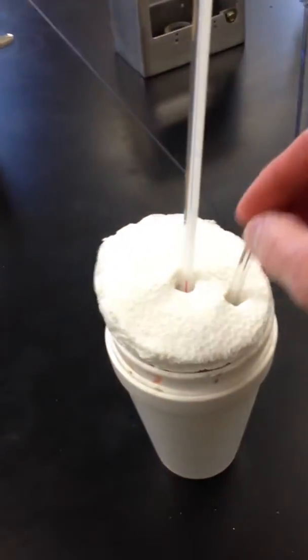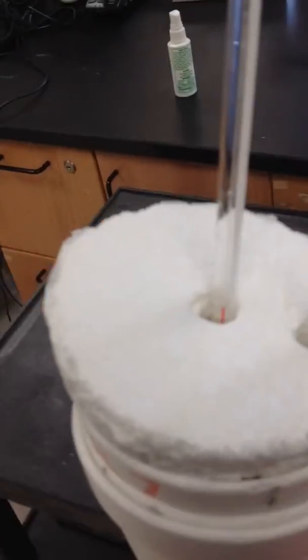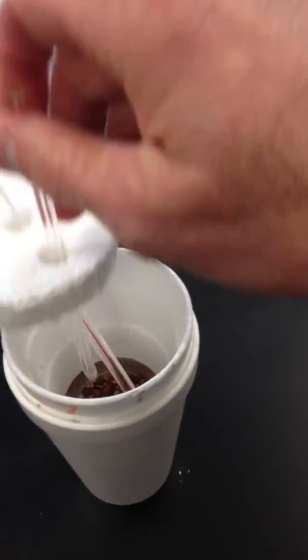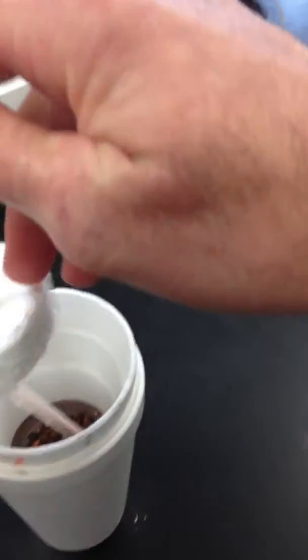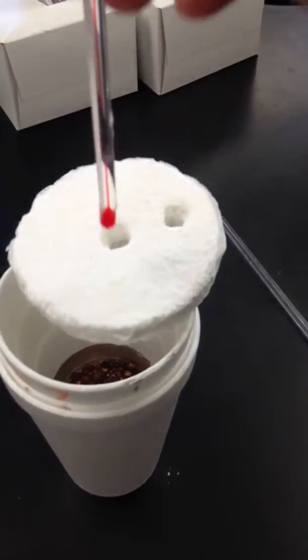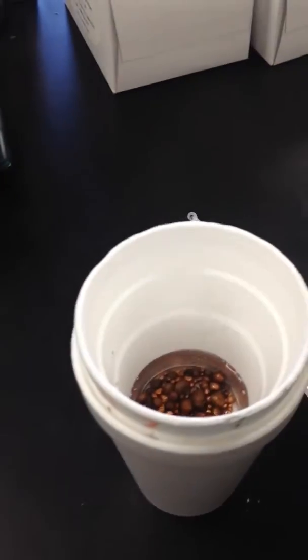One thing that will make this lab a lot easier is if instead of using a manual thermometer, you come over here and use LoggerPro. We'll have LoggerPro set up so that you can take the temperature using a thermocouple instead of a glass thermometer. You can just stick your thermocouple through the slot there and use it to take your temperature reading, and that will make things a little bit easier for you.